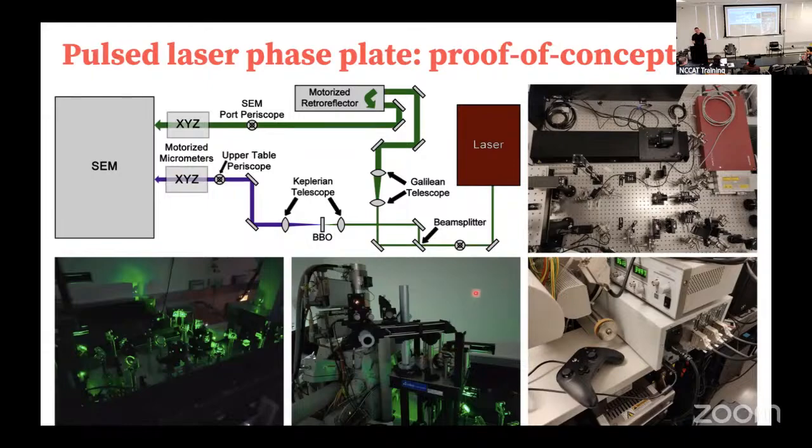And the way that we control the synchronization between the green laser light and the UV generated electron beam is, you could imagine that they could have different timings, right? So one comes in, the other one misses it by a mile. And so we have this, it's called an optical delay line, and all it really is, shown here in black, is just a mirror that moves along a track. And so you can position this mirror wherever you want. And whenever you have perfect synchronization between the electron packets and the green laser beam coming in, that's time zero. That's called time zero. So that's where you find perfect synchronization.